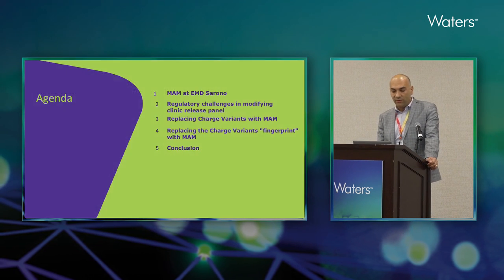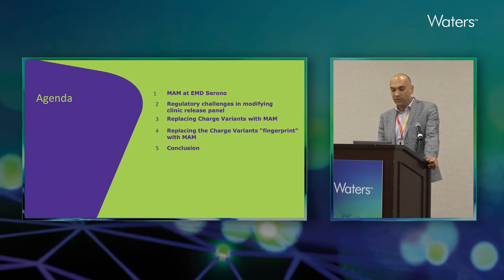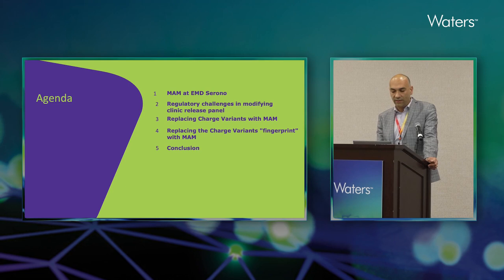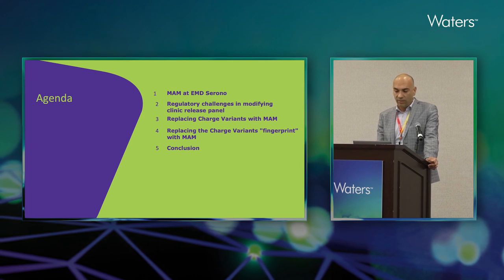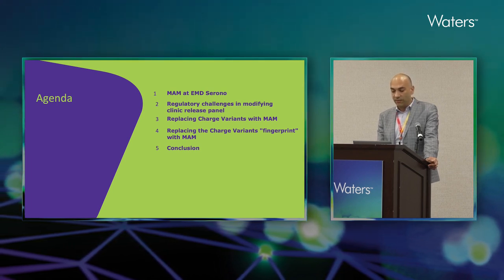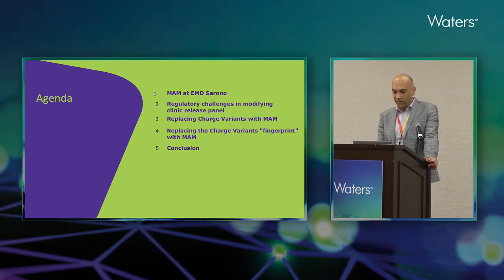So the agenda of today's talk: I will be talking about MAM in EMD Serono, about some regulatory challenges that we have been experiencing in modifying the clinical release panel, especially about how we are planning, or actually replacing, the charge variant analysis with MAM, and also specifically about how we have been modifying and substituting the fingerprint concept with MAM.